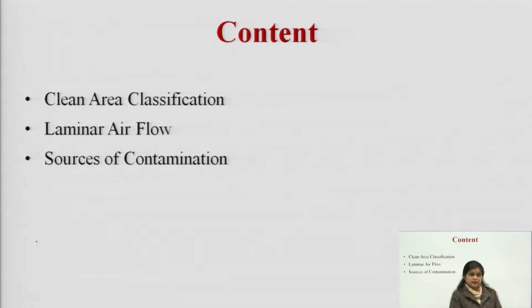And now in this lecture we will cover the clean area classification in detail, along with the laminar airflow unit, which provides an aseptic area, an environment that must be free from microorganisms.